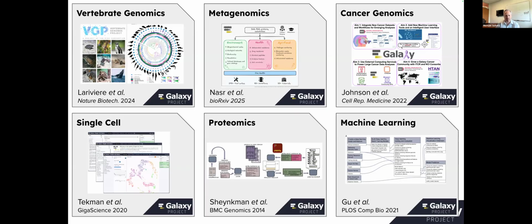Another major area relevant to today's discussion is metagenomics, where we have thousands of tools and hundreds of workflows available to go from raw data and do a whole variety of different analysis in terms of which genomes are there, what species are there, which genes are there, and do they have any important pathways for diseases or other compounds that are being produced. We have a very rich environment for all that analysis. That'll be the main focus for today.